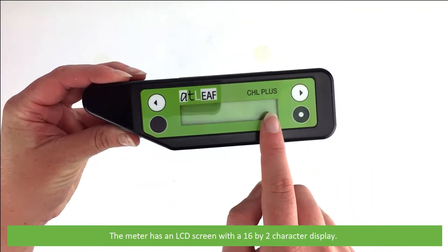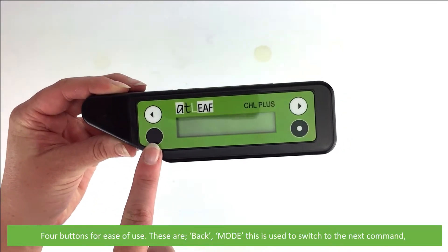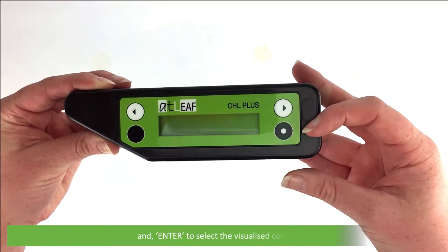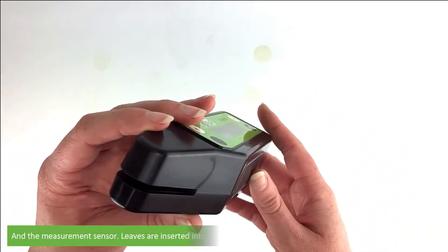The meter has an LCD screen with a 16 by 2 character display and four buttons for ease of use. These are: back, mode — which is used to switch to the next command — forward, and enter, which is used to select the visualize command.